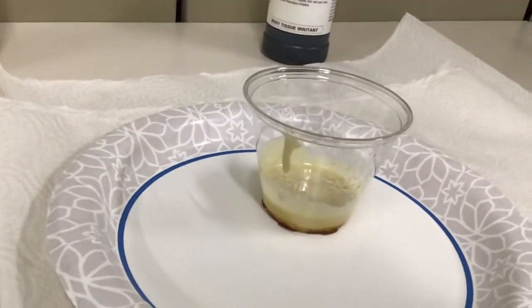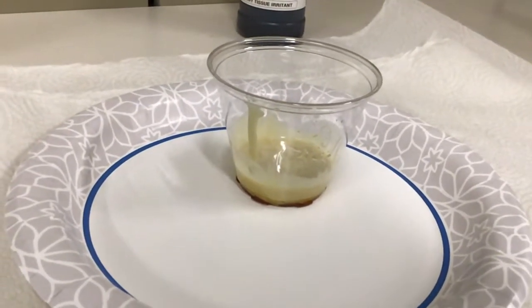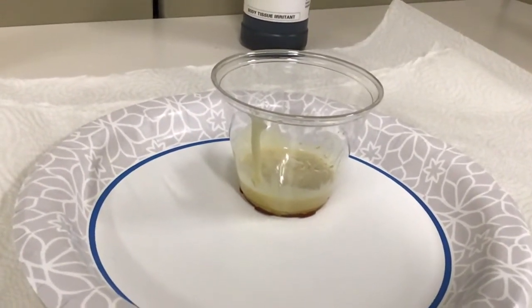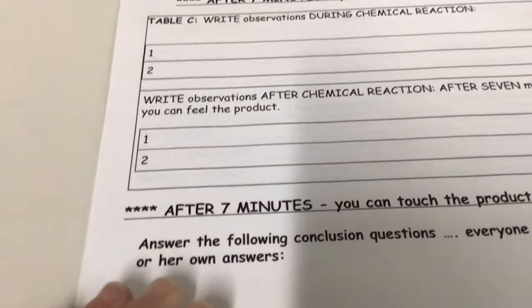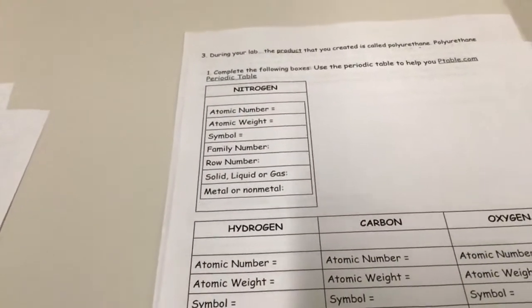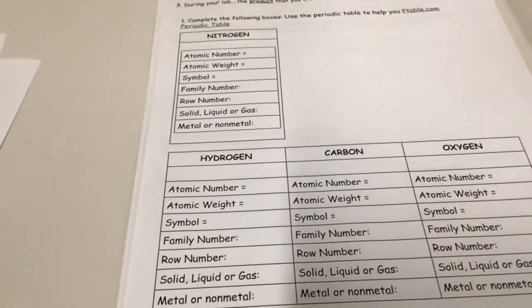Okay, so I'm going to start my timer, or have started it. And as we are waiting for the 7 minutes, we can go ahead and work on looking at our periodic table and filling out some of this information about nitrogen, hydrogen, carbon, and oxygen.